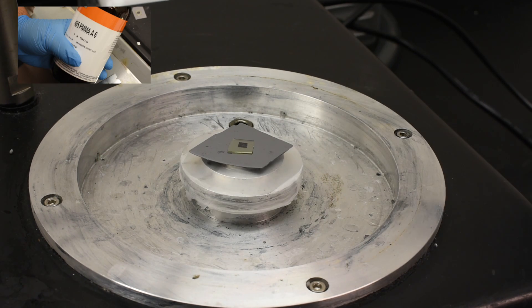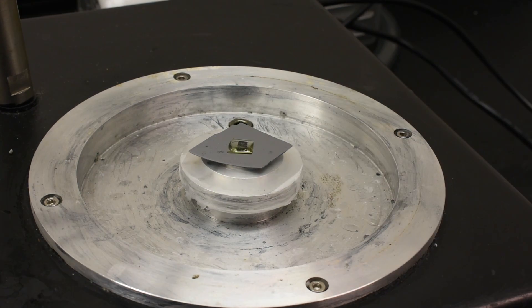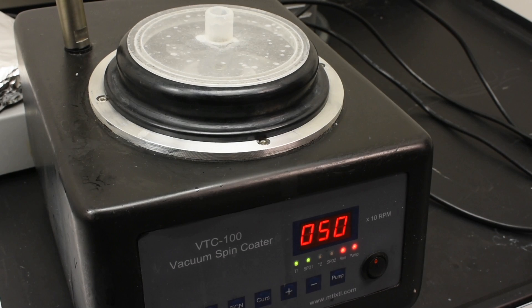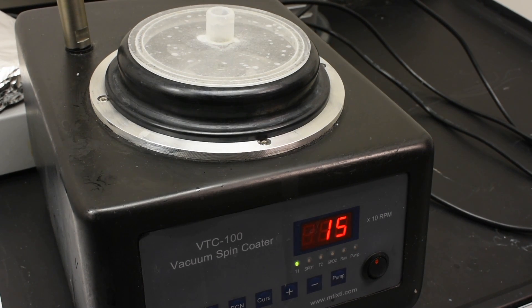The sample is moved to the spin coater, where two drops of 495 PMMA A6 is applied. The sample is then spun at 500 RPM for 15 seconds, followed by 4500 RPM for 45 seconds.